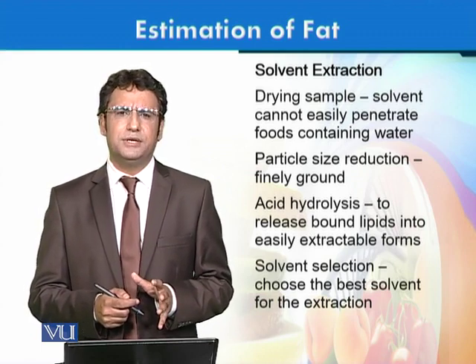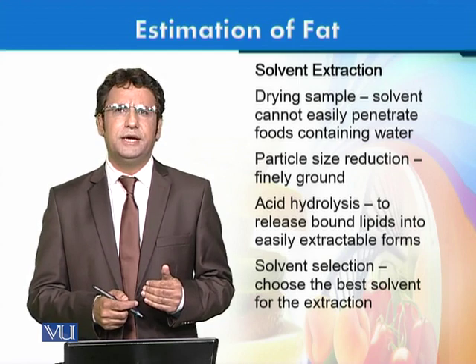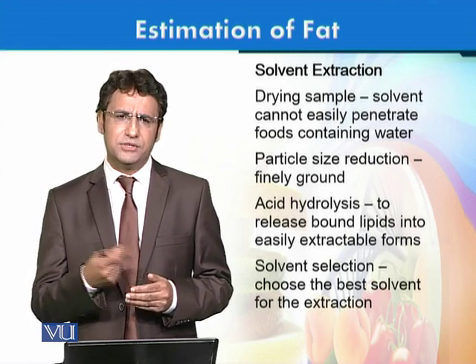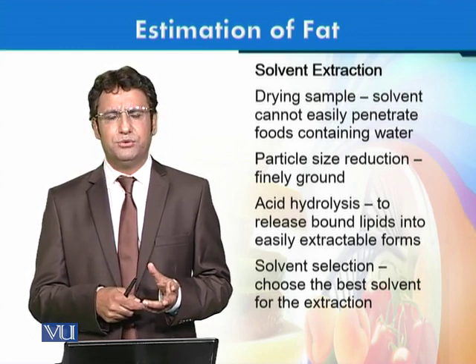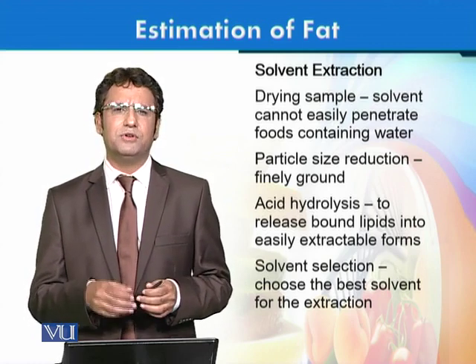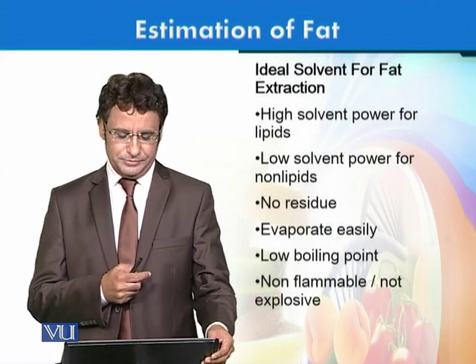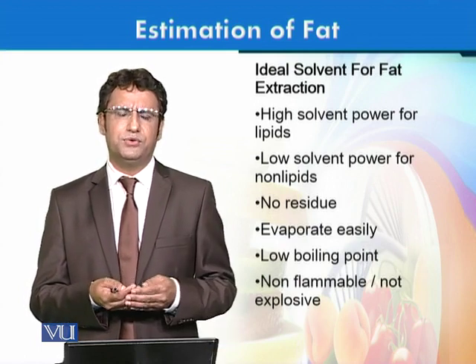Certain food contents would need to be pre-treated before doing the actual analysis, because in certain foods maybe the particle size is too high. We need to reduce that particle size to facilitate the removal of fat with solvent, and similarly we need to also dry certain samples to reduce the amount of moisture present in food that would otherwise interfere with the removal of fat contents, and there might be error in the final results if we don't do this pre-treatment of samples.